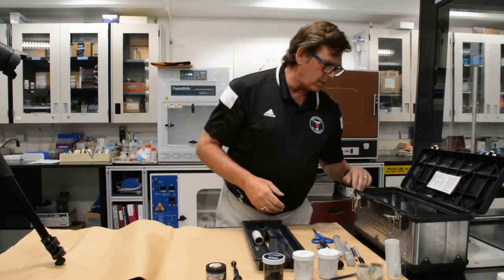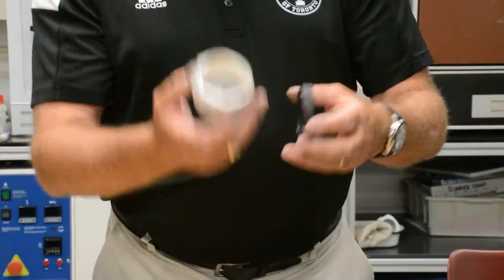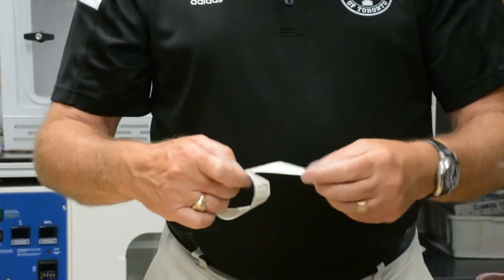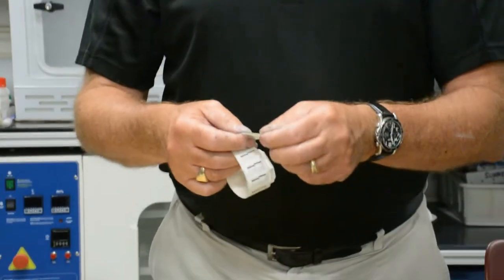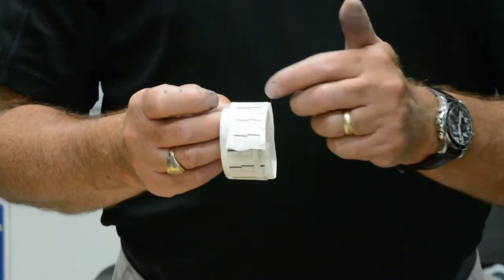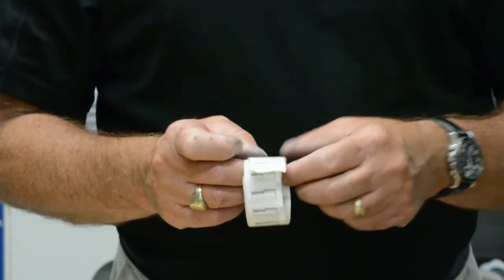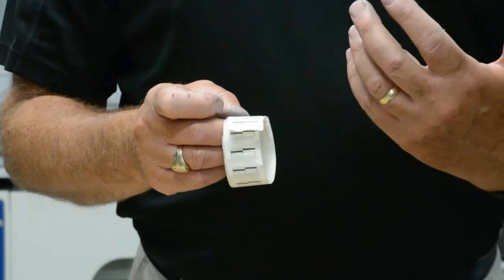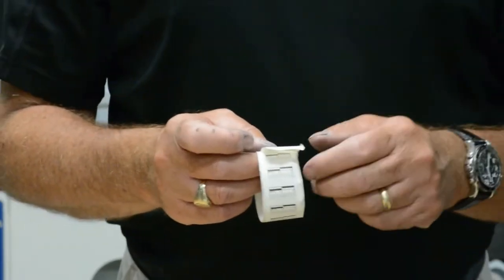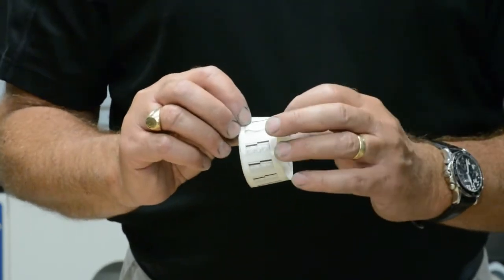Next on our list is scale stickers. The ones that we use, we house them in these old fingerprint powder jars for convenience purposes, and they are the peel and stick variety. So I'll just peel off the excess here. They come in a variety of different styles. These ones here are 20 millimeter measurements, the graduations that are on there. They have a sharp contrasting black and white bar for sharpness when you're photographing it, to ensure that the camera is able to focus on the targeted surface, and you can see the graduations.